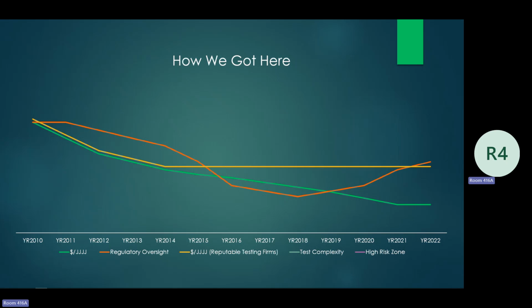Again, the ASTM method is more relaxed, less prescriptive. So what EPA is trying to do with the modified or the proposed Method 320 regulations is take the FTIR method and allow it to look more like their traditional test methods, Method 7E for NOx, Method 10 for CO. And what it shows is a lack of understanding in the FTIR technology to begin with.